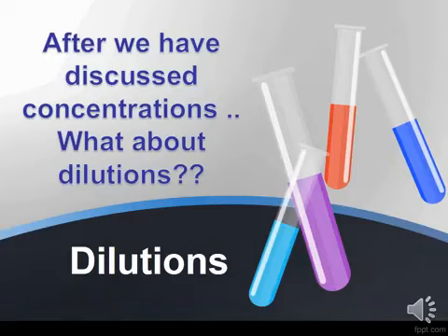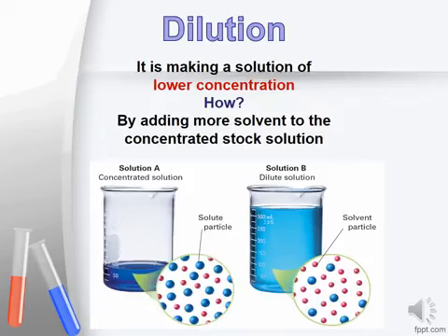What about dilutions? Dilution means making a solution of lower concentration. I'm going to make a solution of less concentration. How do I get lower concentration? To get lower concentration, we add more solvent.